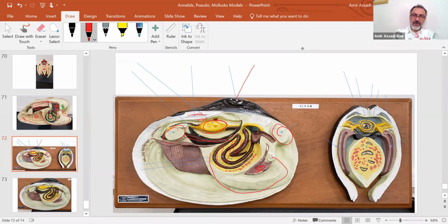And then the yellow is the gonad, gills, mantle. Cross section, you do have microscopic slide of it. Gills, mantle. Inside of the foot are intestine, yellow gonad.